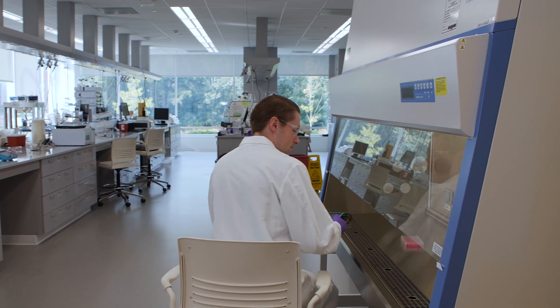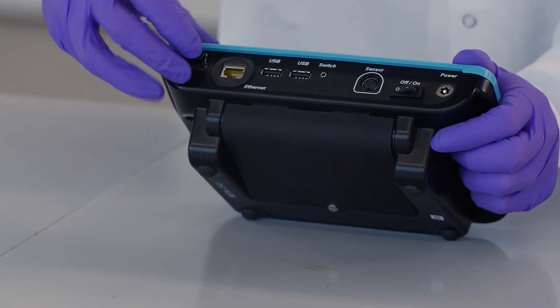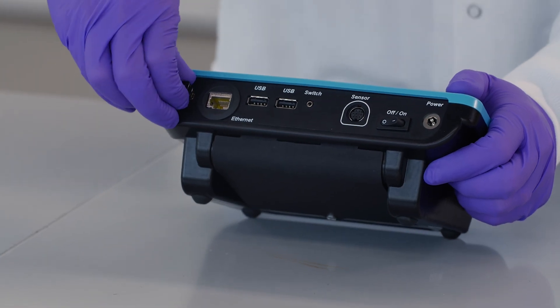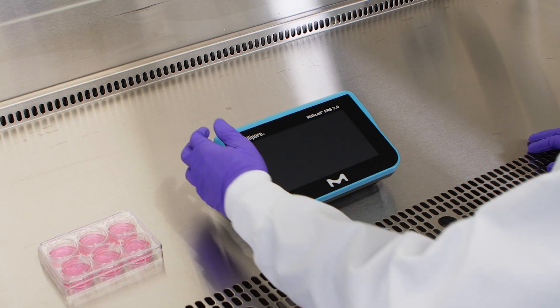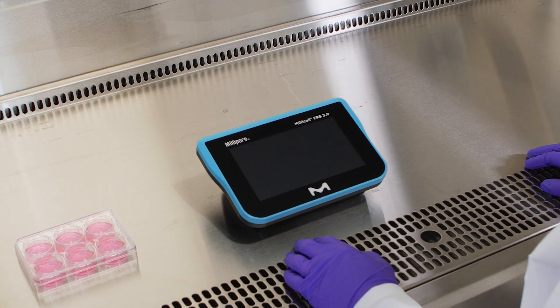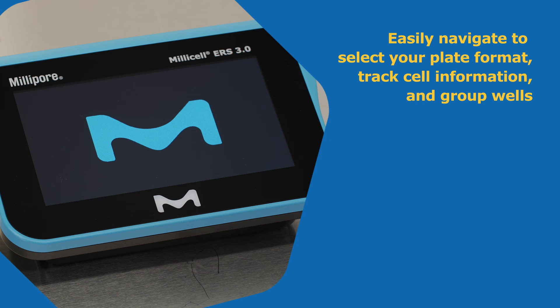Our newest TEER instrument was developed with user-friendly enhancements to streamline data capture, including USB ports and wireless data export. The latest of our connected lab instrumentation portfolio, the Millicell ERS 3.0 offers an intuitive touchscreen interface for ease of use.